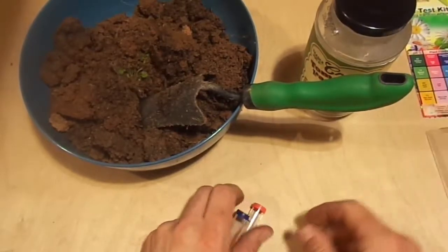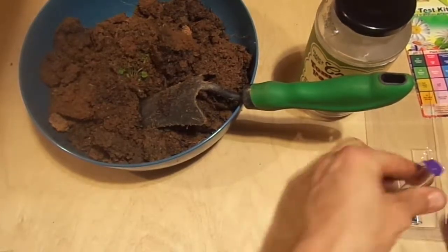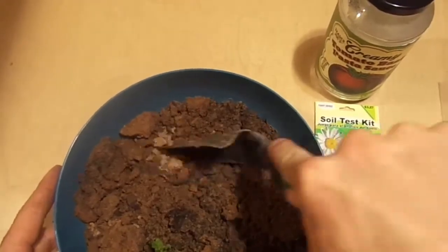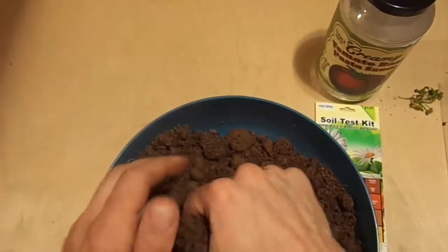The directions were clear enough and it was fairly simple. I took a sampling from about ten different spots of the garden, put it together, mixed it up, and then it says to put one part dirt and five parts water in a canister, shake it up, let it set for a few minutes, and then run your test, which I did.